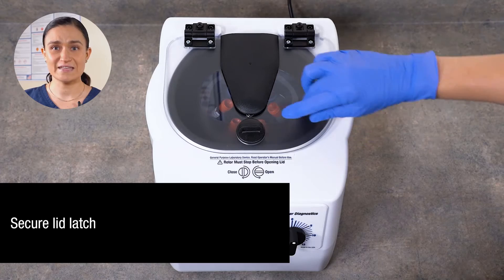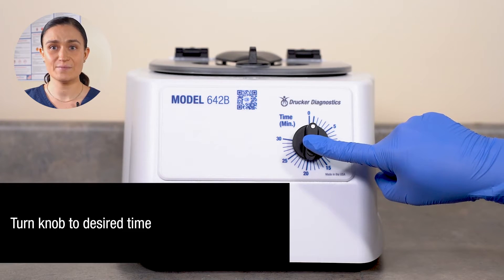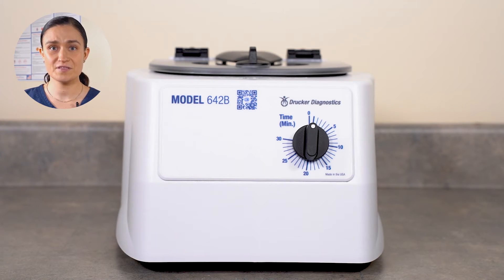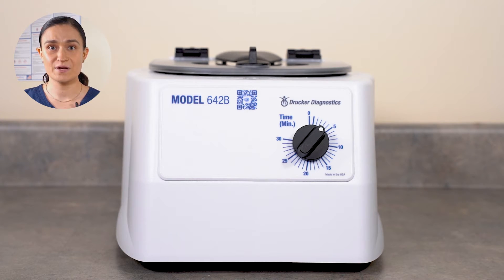Close the lid. Secure the lid latch by pressing it down gently and turning it a quarter turn counterclockwise. Next, select your time using the timer knob. The numbers around this knob indicate minutes of spin time. You may select any value from 0 to 30 minutes. In our case, we're going to run for 3 minutes, but you can run whatever time you like. Once you set the timer, the centrifuge will start automatically. The rotor will begin to accelerate and the centrifuge will run for the time selected. Once the run is complete, the centrifuge will begin to slow down, eventually reaching a complete stop. You may then open the lid and retrieve your samples. Remember, your 642B has adjustable time, but its speed is preset and cannot be changed — it will always spin at 3400 RPM, which is 1600 XG.